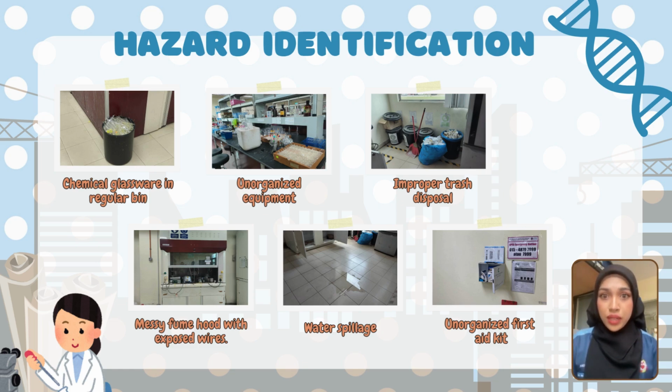So how did this happen? This happened because the person in charge of this laboratory did not take it as a serious matter. Although they know the consequences of the chemical hazard, they did not take it as seriously as they should. This can harm not only the people inside the science laboratory, but also outsiders if the chemical trash is taken outside without proper procedures.